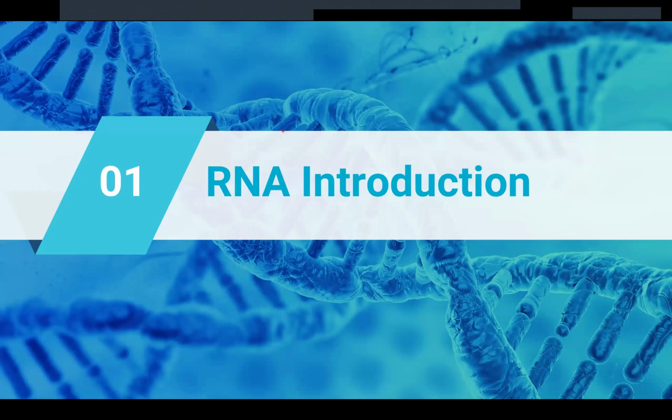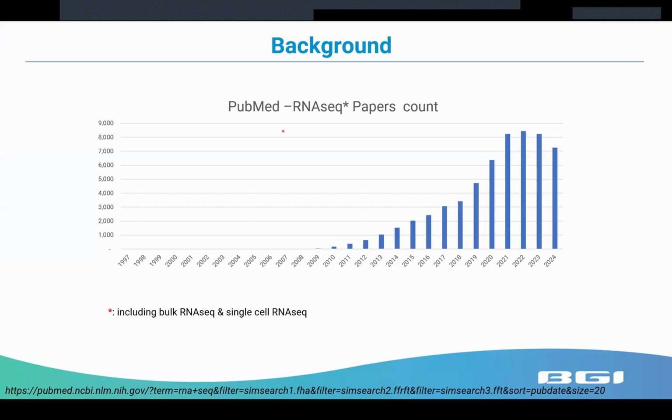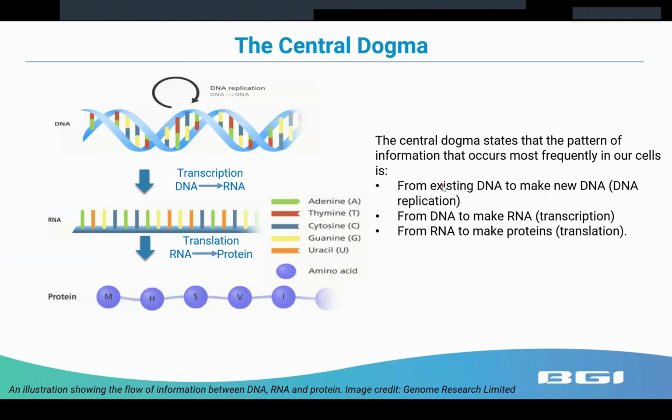Before talking about RNA sequencing, we need to know RNA first. Actually, RNA-seq is a quite popular tool for biological research. You can see from the chart here, the RNA-seq related scientific publications increased year by year for the past 15 years. Then how is RNA generated and where is it from?